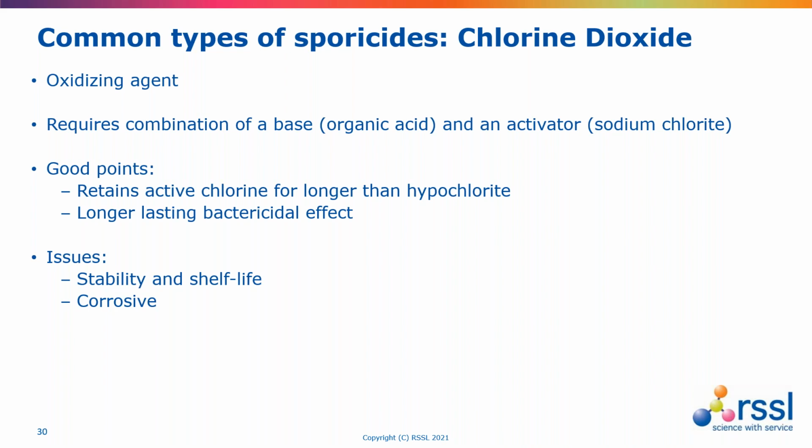And it tends to last longer than ready formulated hypochlorite, but there are still issues of stability and how long the chlorine remains active for. So making up this type of disinfectant solution to use in a bucket, you need to understand how long that remains active for, whether that's 4 hours, 8 hours, 10 hours, whatever, and that needs to be backed up by some form of qualification study. And these days, chlorine dioxide tends to be preferred over hypochlorite, because hypochlorite is effectively bleach and it becomes more challenging for the operators.